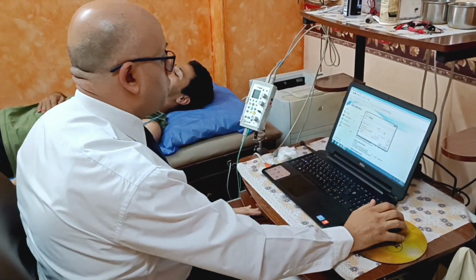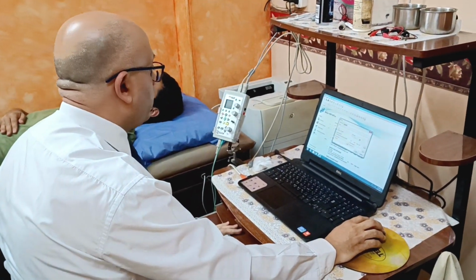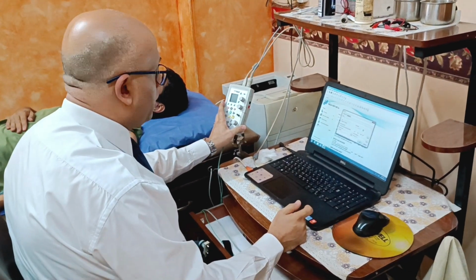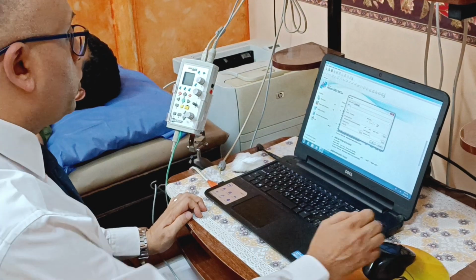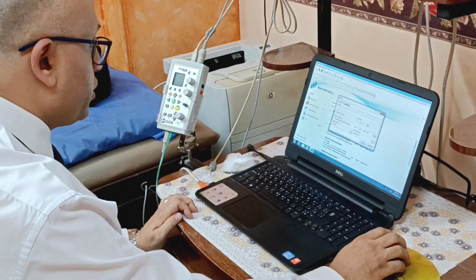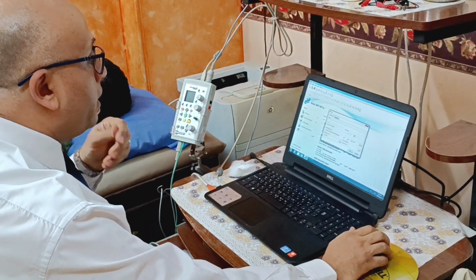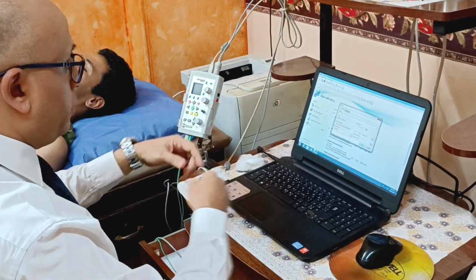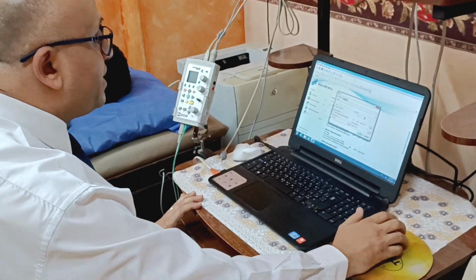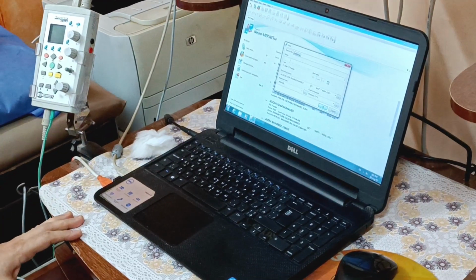All, dear physios, I will talk about the practical issue, the second part after the theoretical part. First of all, we will talk about the instrumentation, the machine itself. Regardless of the type of the machine and the commercial version, there are standard parameters for any machine.